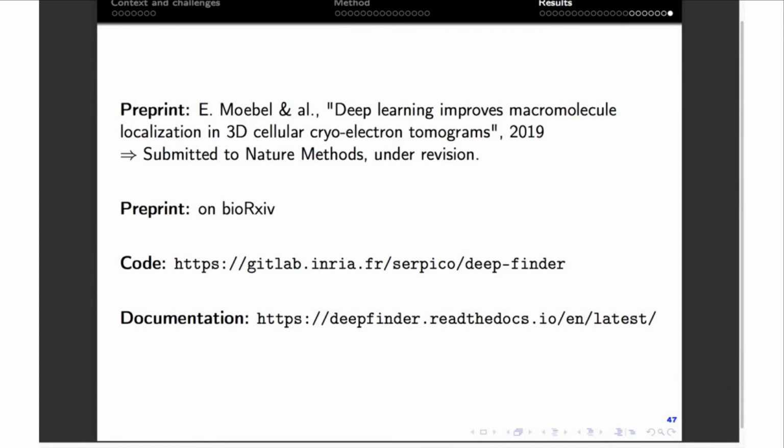I was thinking about the question José Luis Vilas made before, and continuing with this specific question, is it possible to use some kind of particle which has been reconstructed after a subtomogram averaging workflow to then feed again a DeepFinder just to make it look only for one kind of particle, only this specific shape, like a template matching, but more specific to the project you are working with?